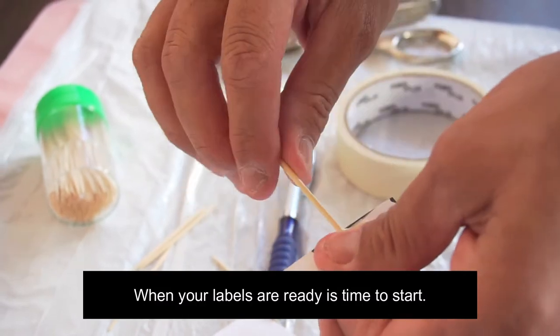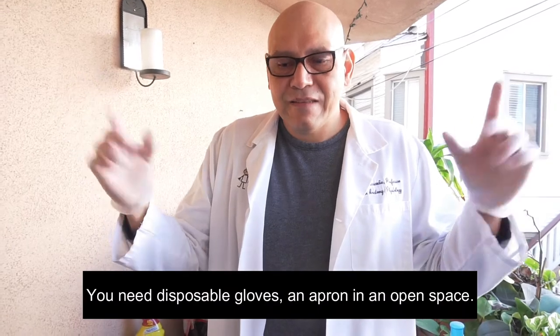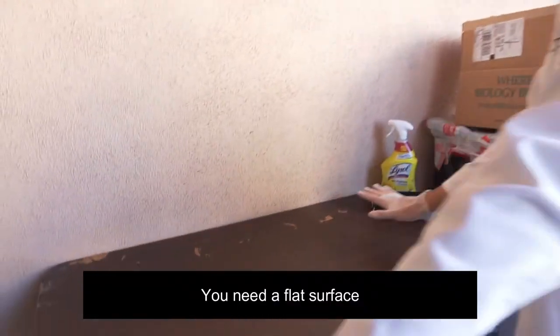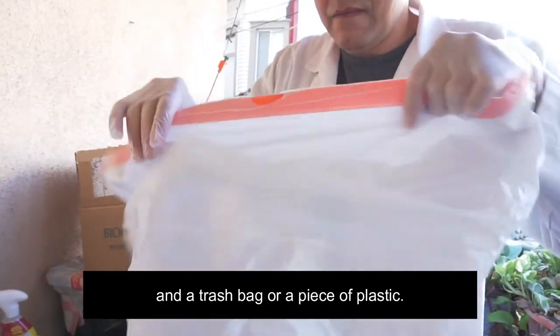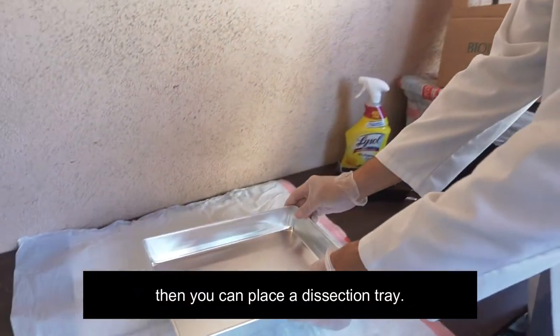When your labels are ready, it's time to start. You need disposable gloves, an apron, and work in an open space. You need a flat surface, some paper towels, and a trash bag or a piece of plastic. Then you can place a dissection tray.